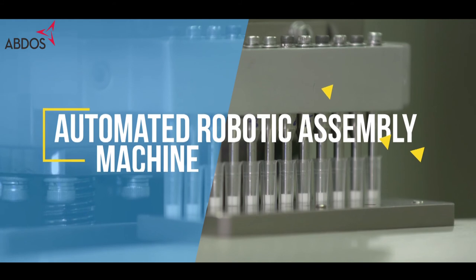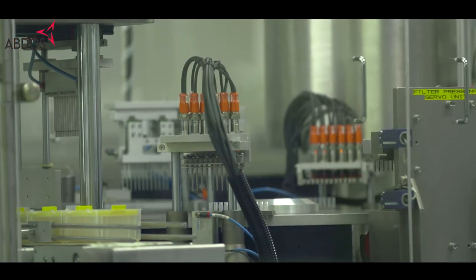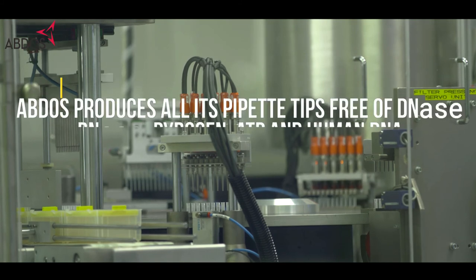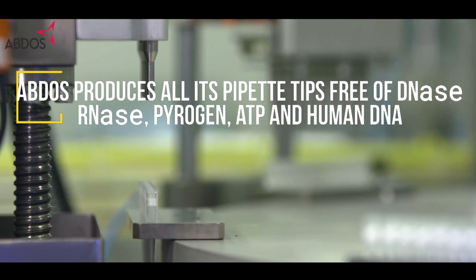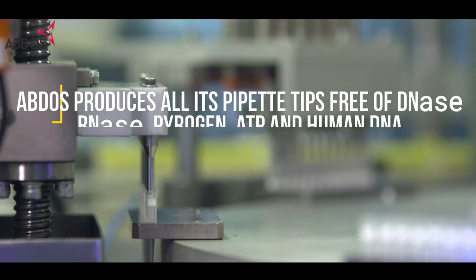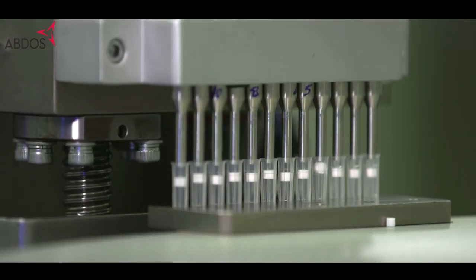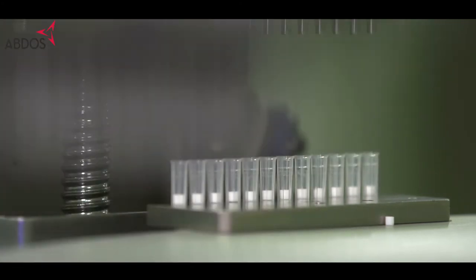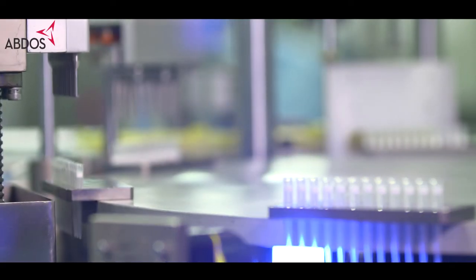With state-of-the-art automated robotic assembly machines and cutting-edge technology, ABDOS produces all its pipette tips free of DNase, RNase, pyrogen, ATP, and human DNA. Automated robotic lines for filter assembly ensure uniform and precise filter placement for every pipette tip assembled by ABDOS.